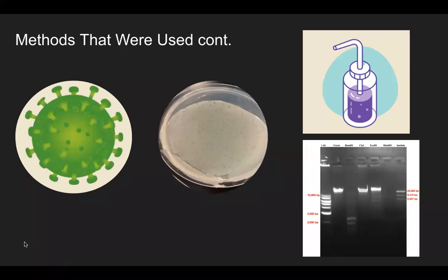Using undiluted phage samples, we created plaque assays to obtain well-isolated plaques. This helps us to create a pure phage population as well as determine phage morphology. We then prepared a high titer lysate that allows there to be sufficient DNA in the sample.